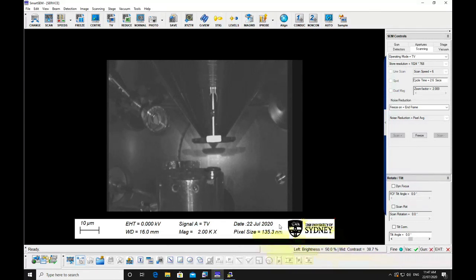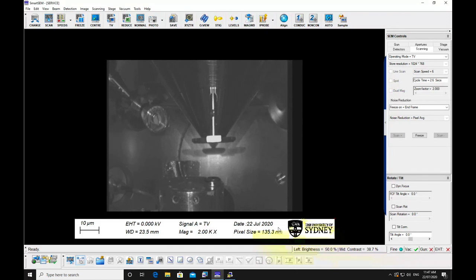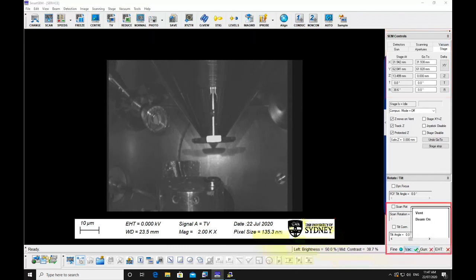Wind out EDS detectors if you have used them. Return the stage to zero tilt. Vent the chamber.